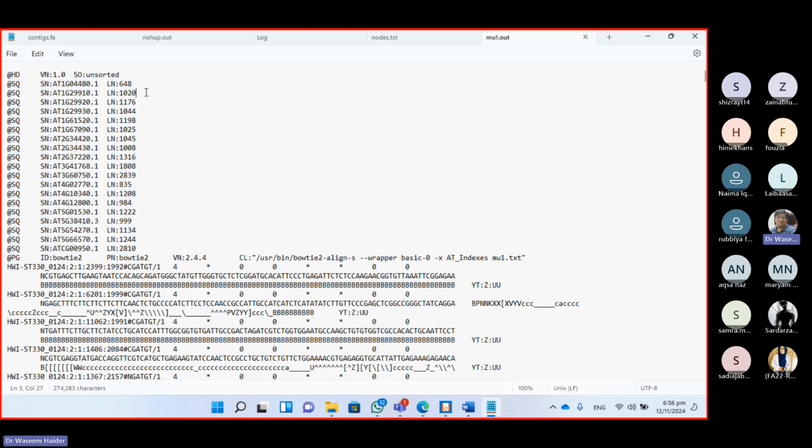That format is called SAM, sequence alignment and mapping, right? But in machine language, later on we convert it into BAM. Some of the tools directly convert it into BAM files, which are just ugly characters, asterisks and squares and cubes and anything like that. But here you can see the ATGCs, so that's SAM format. Here he's giving us those gene IDs, and then he's talking about their lengths.